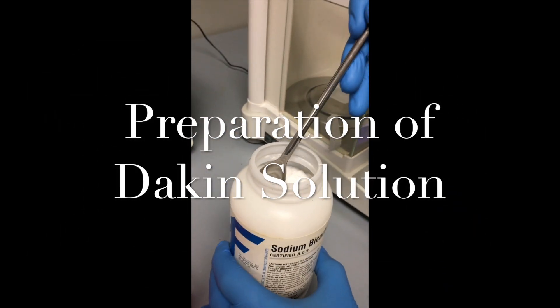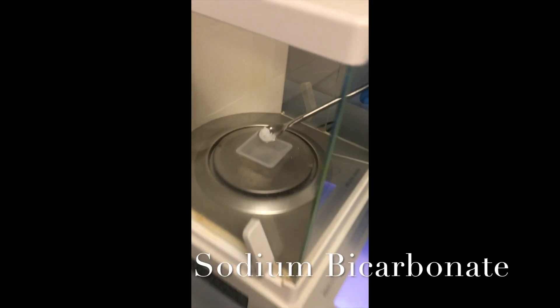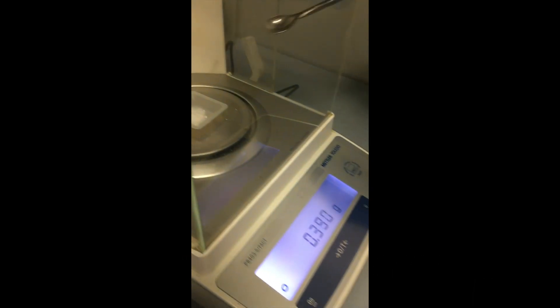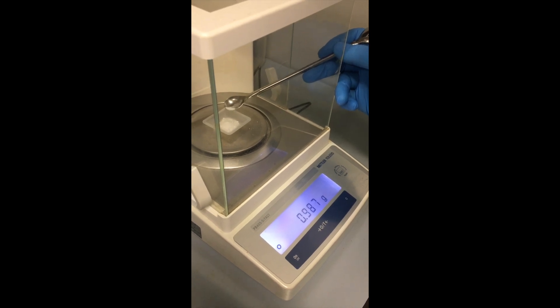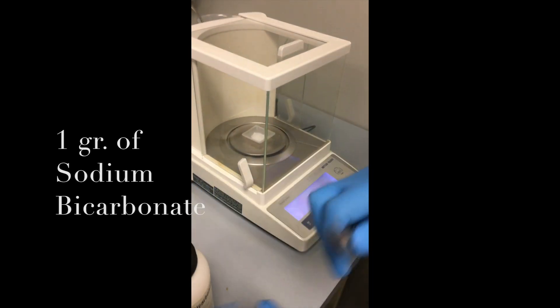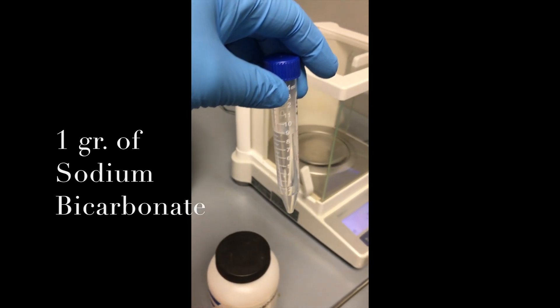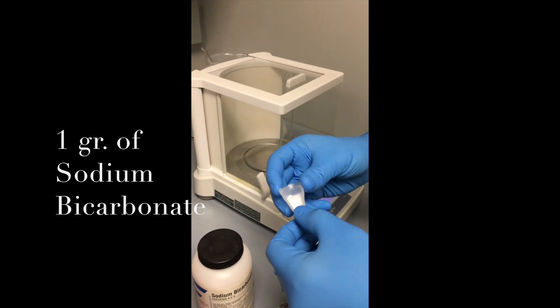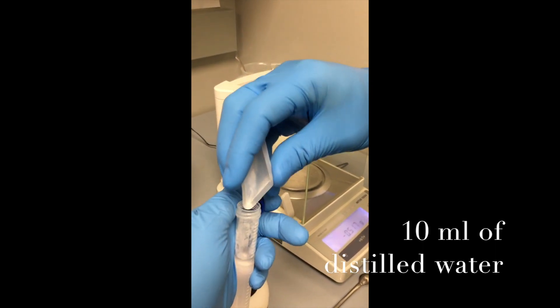We're going to weigh one gram of sodium bicarbonate in order to prepare a 10% sodium bicarbonate solution. This solution is used to buffer the sodium hypochlorite. It is one gram of sodium bicarbonate for nine milliliters of water. The solution is considered a weight-to-volume ratio — one gram of sodium bicarbonate in 10 ml of water.